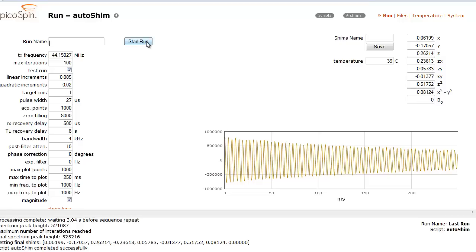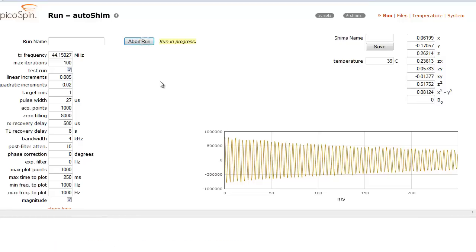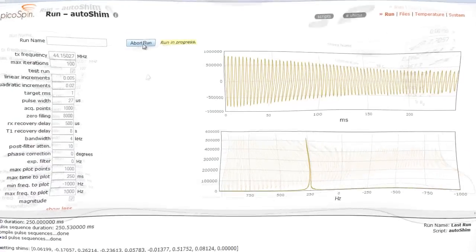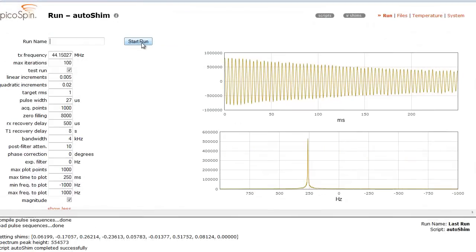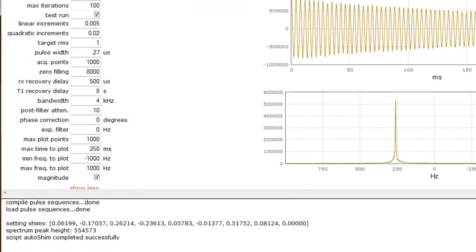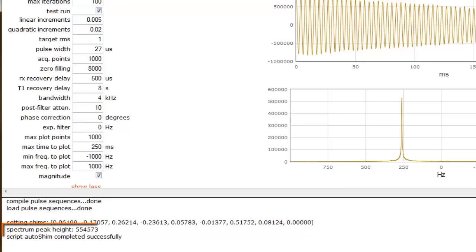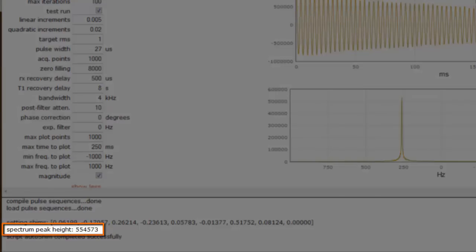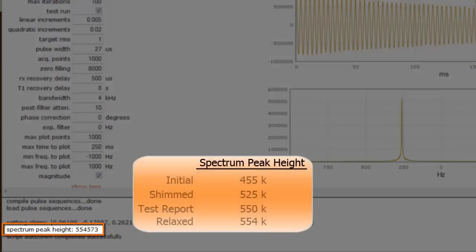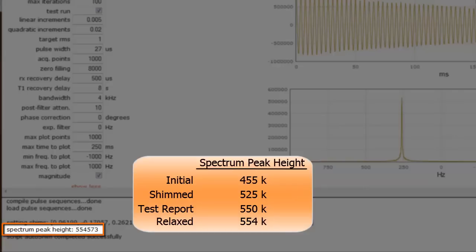If I execute a test run, these shim parameters will be written to the shim electronics overriding previously stored values. But in this case, these are the same shim values since we just saved them to this file. Since it's been at least 30 seconds, the spectrum peak height we obtained is a relaxed value and comparable to the test report. Our goal was to achieve a value of 550,000 and after shimming we obtained 554,000. This unit is shimmed and ready to go.